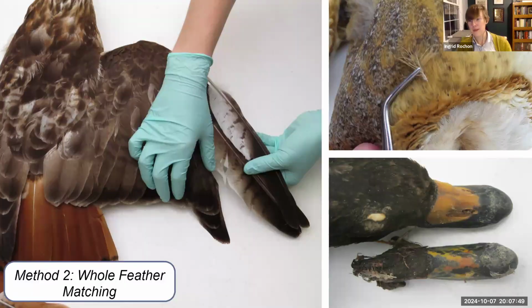We are able to do some pretty incredible whole feather matches with the Smithsonian's collection at our fingertips. So we can really confidently identify stuff that has been chopped up in plane engines. We use anything we got, feet, beaks. Like with this black scoter, we have the adult male and we had a beak of an immature male in a bag of snarge. And we said, that looks familiar, let's take it out. Anything recognizable, we'll take it out, we'll give it a go.